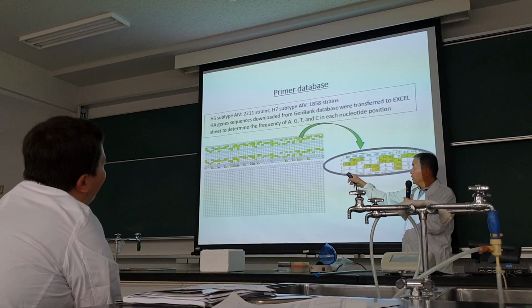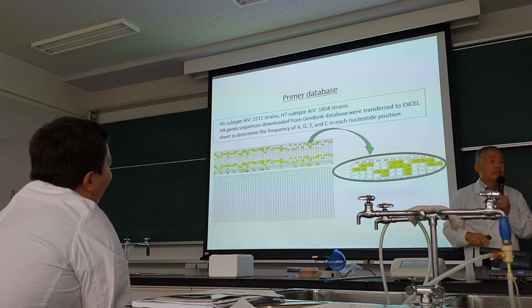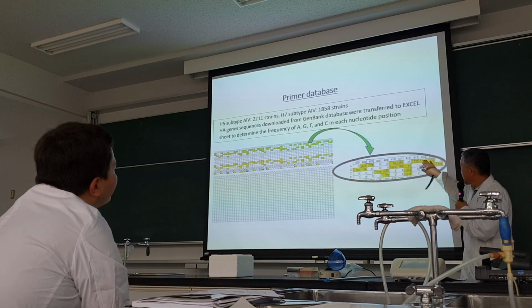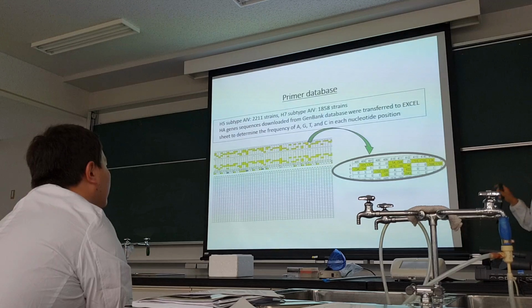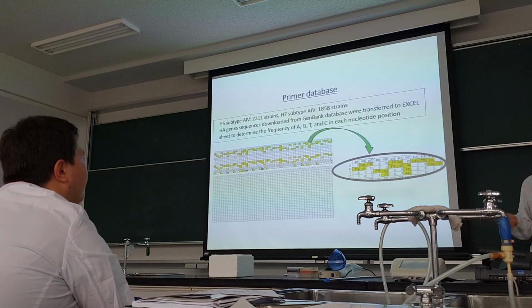A, G, T, C are here. The position number is 405. For example, most of the genes, except for one, have G. In this way, these are conserved, but these are not conserved. So we look for the more conserved regions, and also design primers by the subpopulation method.